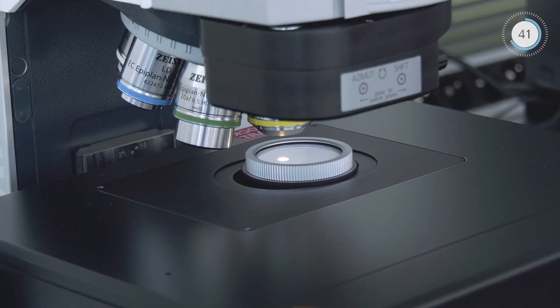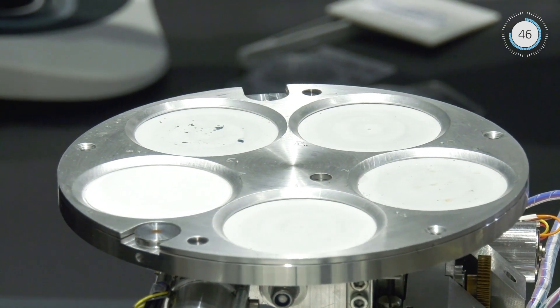Work efficiently with motorized stages and Z drives that provide fast, precise navigation and imaging.